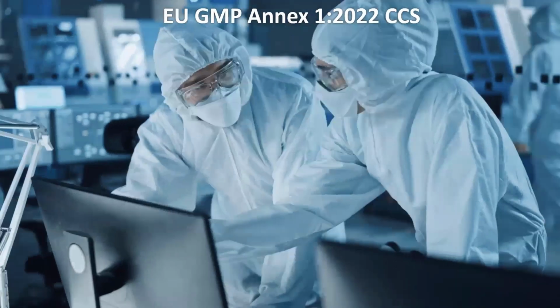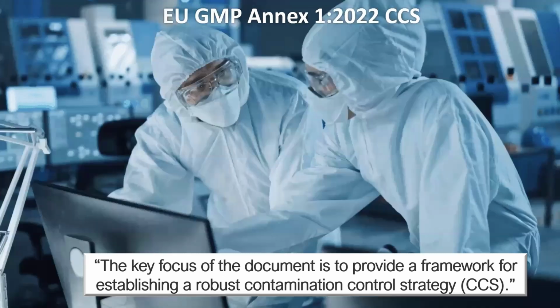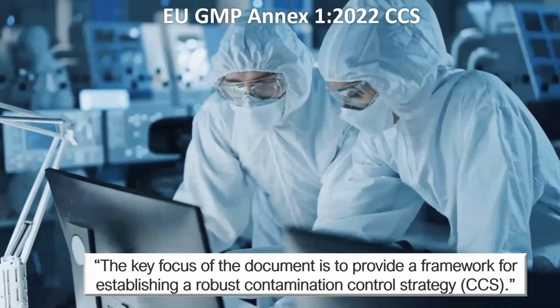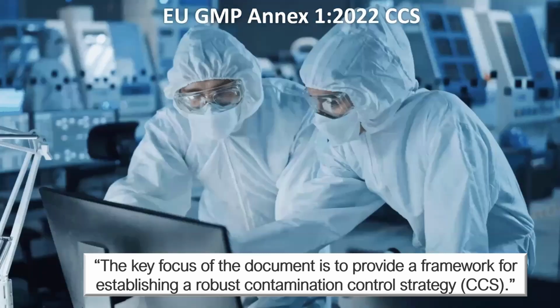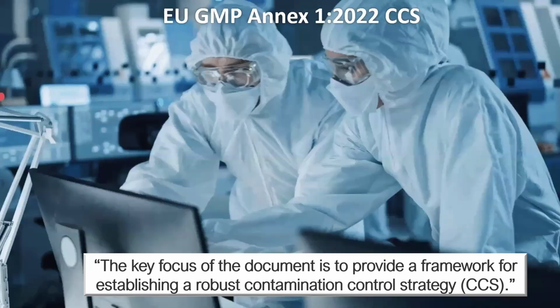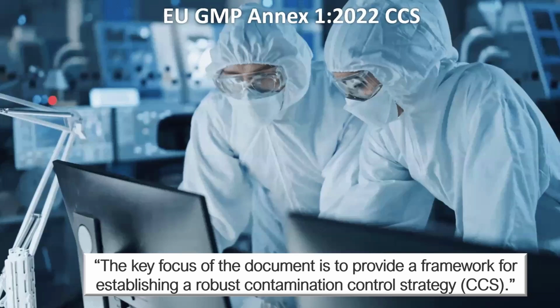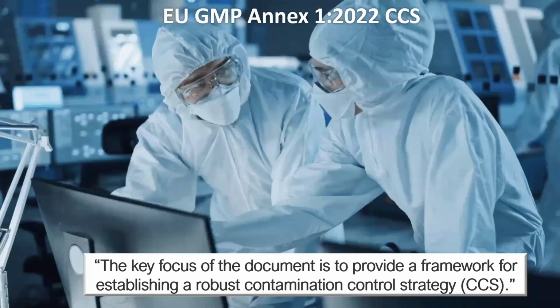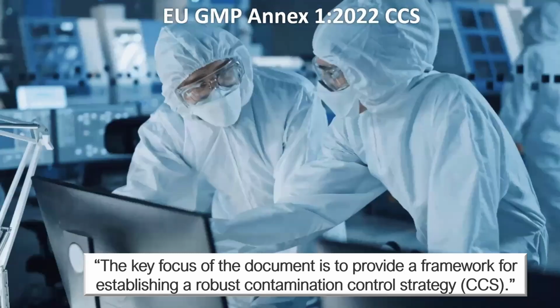and process validation. And the latest version of this EU-GMP was released in 2022, and it came into effect in November of 2023. They've given an extension to November 2024 for separate RAB systems before that gets fully implemented. And in the context of Pharma 4.0, digital data becomes increasingly important for the contamination control strategy, outlining these technologies that become available.